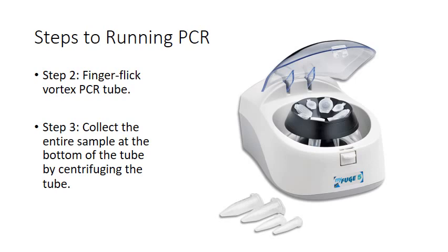Next step, after you've finger flick vortexed your PCR tube, is you're going to collect the entire sample at the bottom of the tube by centrifuging the tube. What you see right here to the right is a centrifuge, and specifically it's a microcentrifuge.